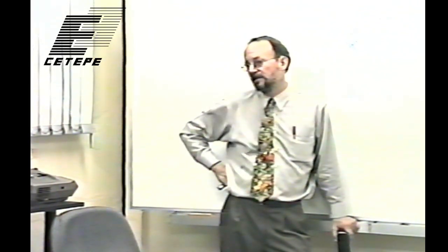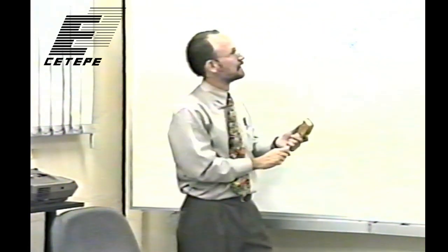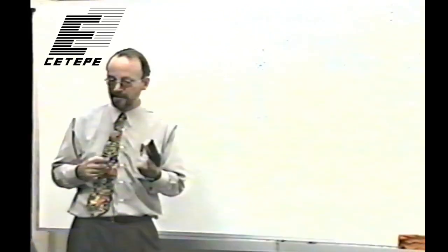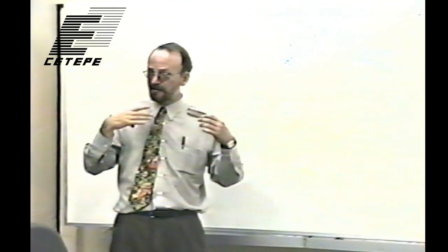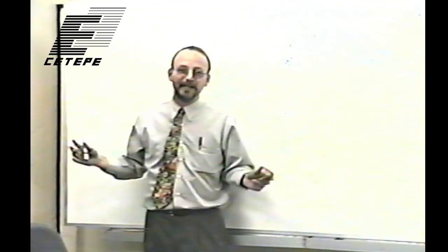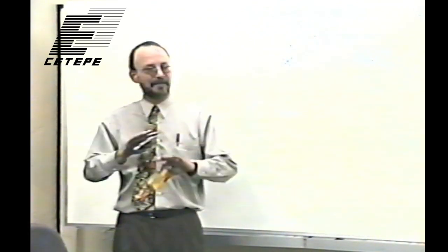expense. One problem with a lot of these crystals, including cesium iodide, and another one is sodium iodide, is that, and you can correct me if I'm wrong with respect to cesium iodide, but there's this nasty property of some crystals called hygroscopicity, or they're hygroscopic, which means that if you leave them out in the moist room air, they absorb water like crazy, more than a sponge, and they just basically melt.